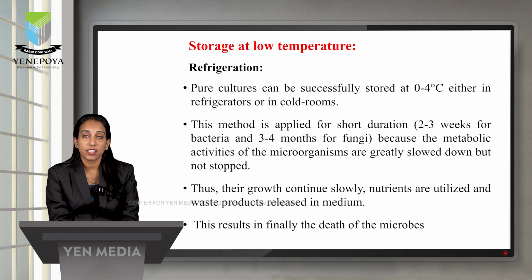If we are taking bacteria, it will be 2 to 3 weeks, or if fungi, 3 to 4 months it will stay. Why such a short duration? Because metabolic activities may happen. Here growth will not be stopping; instead, it is decreasing the growth. Microorganism growth is decreasing, so metabolic activities may happen, so this is only for a short duration.